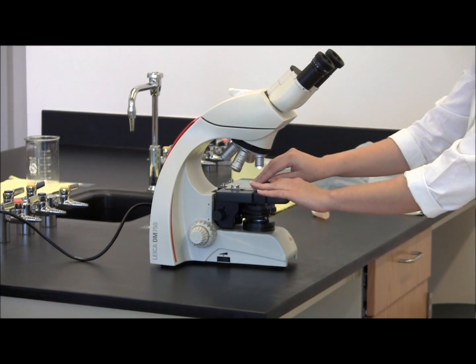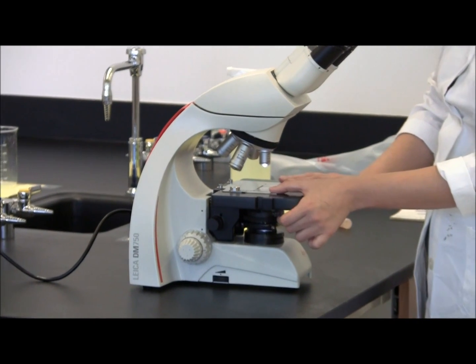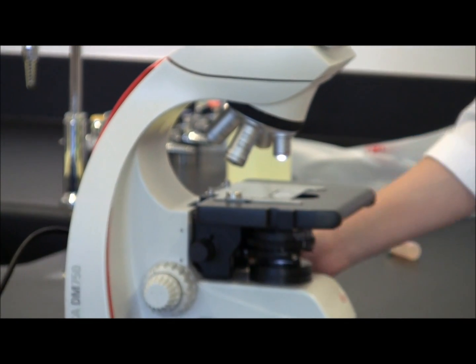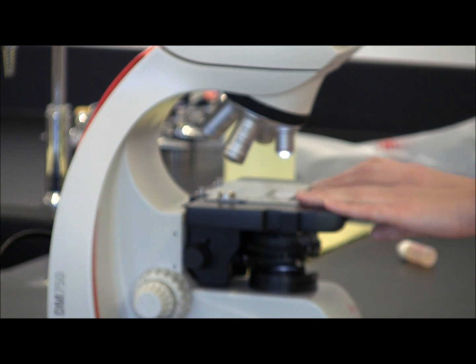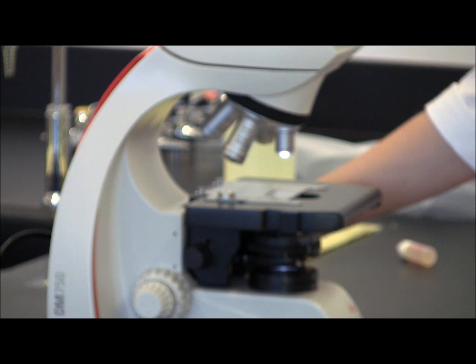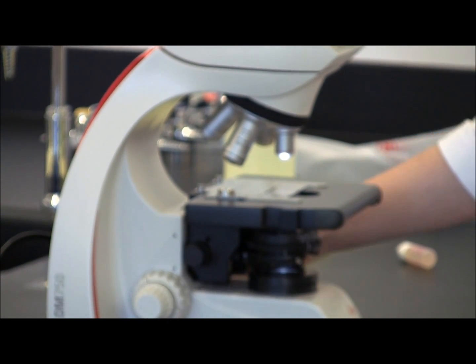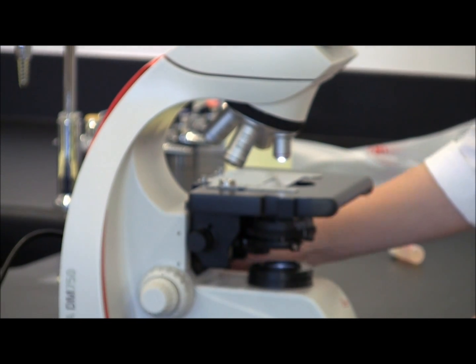So the first thing we're going to do is put the microscope slide onto the stage. This clasp just moves backward and forward and holds the slide in place. The next thing we want to do is align our specimen with the light that's passing through the microscope. What I like to do is start on low power and move the stage to its highest setting.